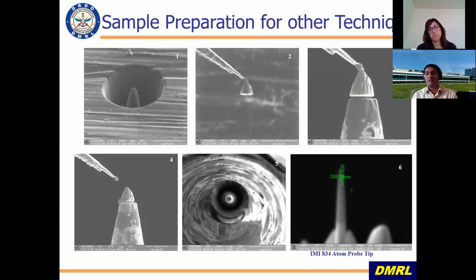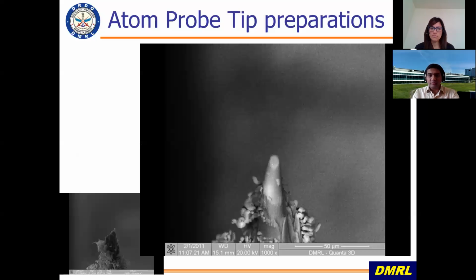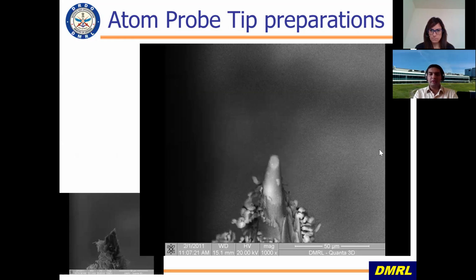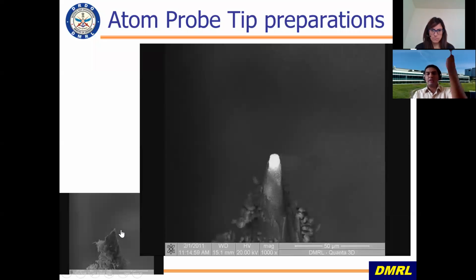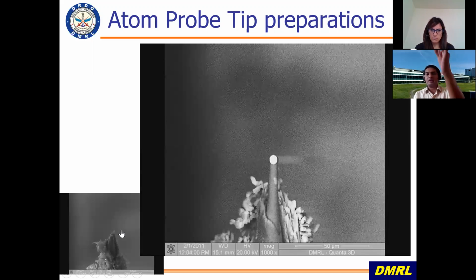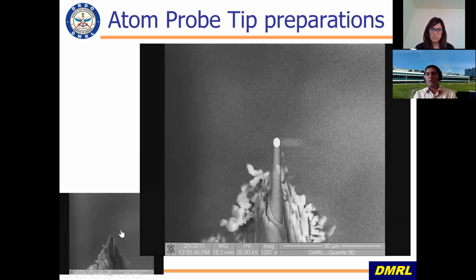So this technique is used for studying nano clusters or features which are not even in a grain, but within the subgrains or at the boundary, some nano clustering at the boundaries. So this is used there. This is just showing how, after making the cylinder, we keep thinning it using the ion beam in a cylindrical manner to arrive at a very pointed tip.